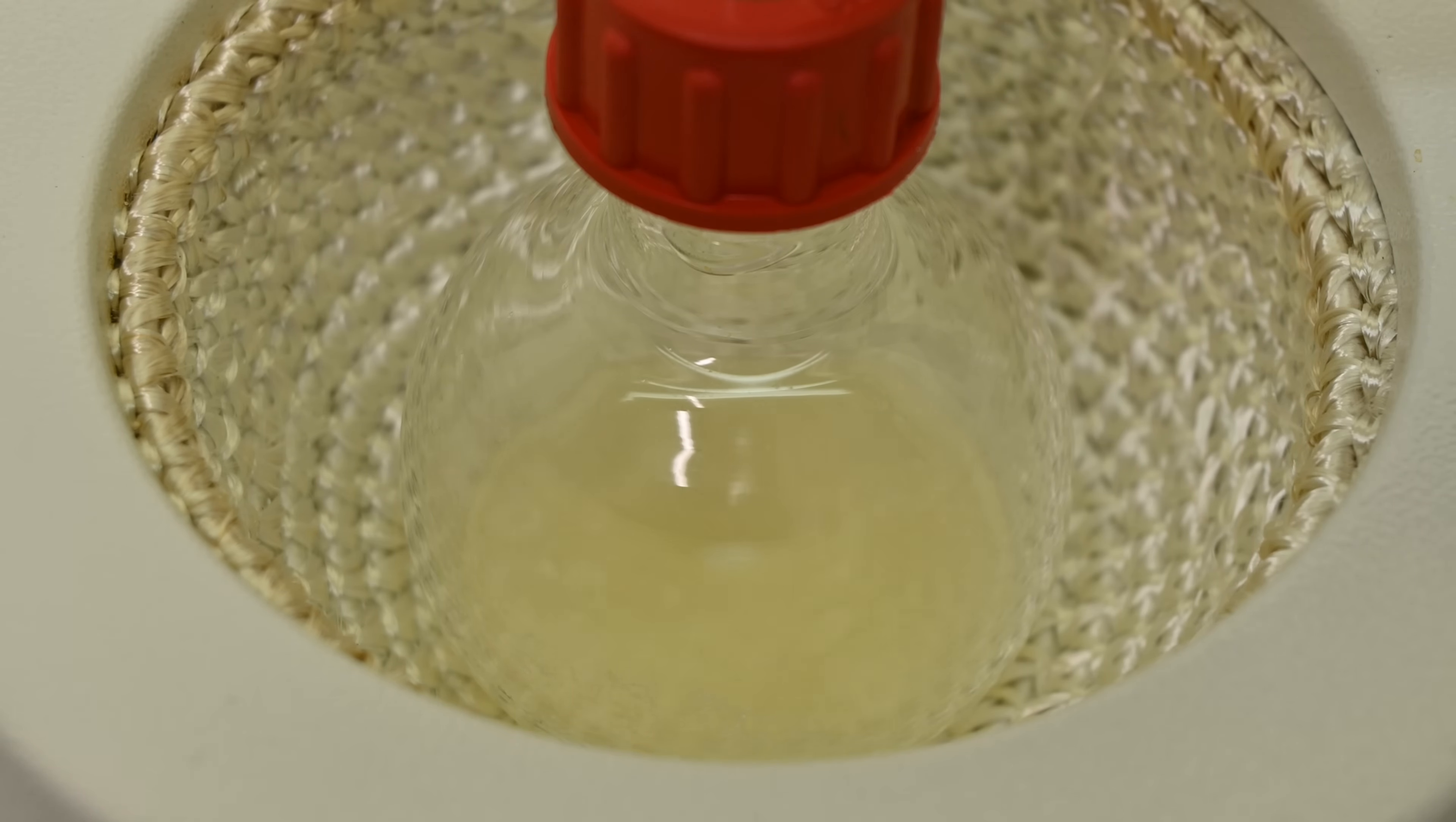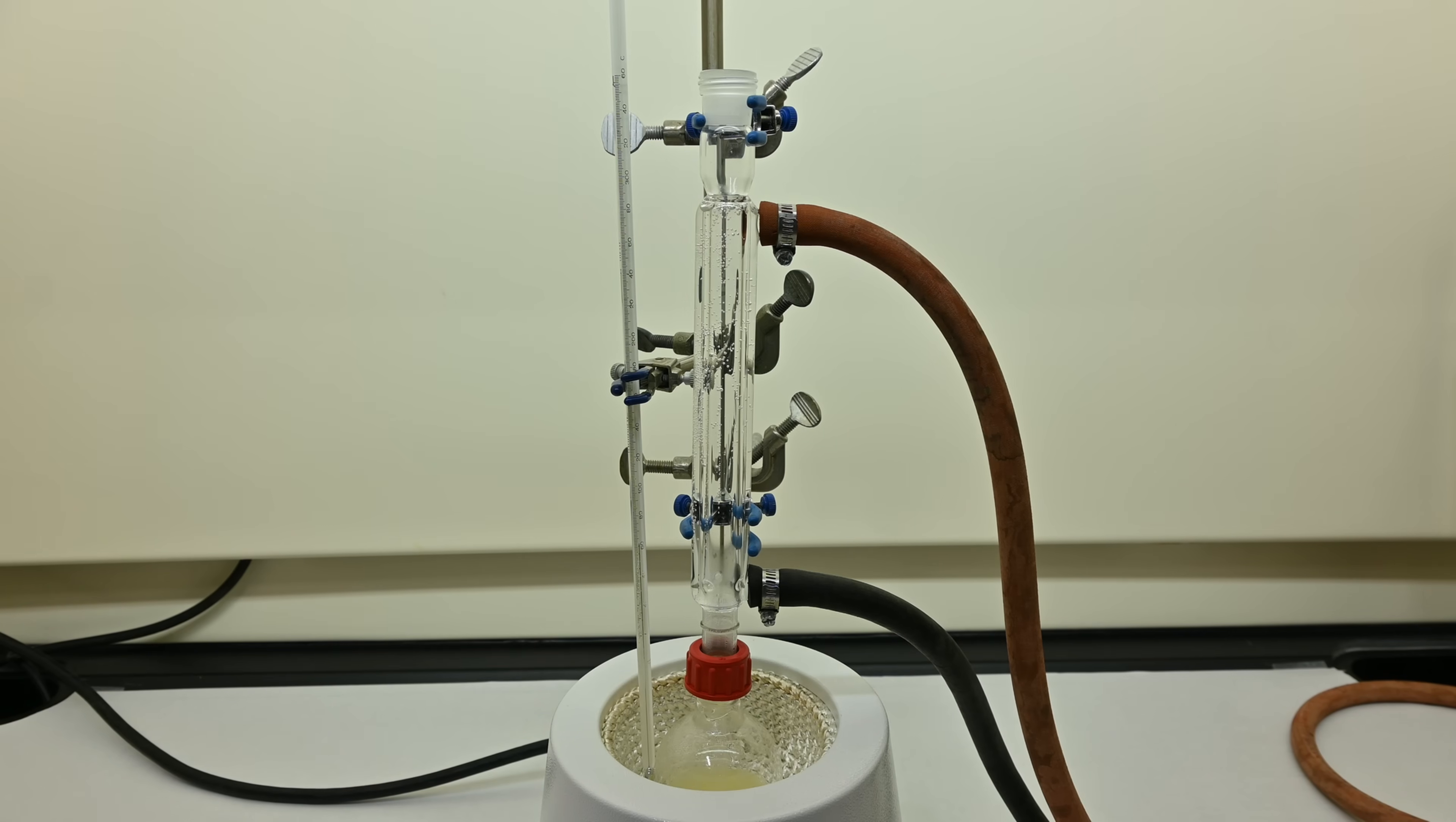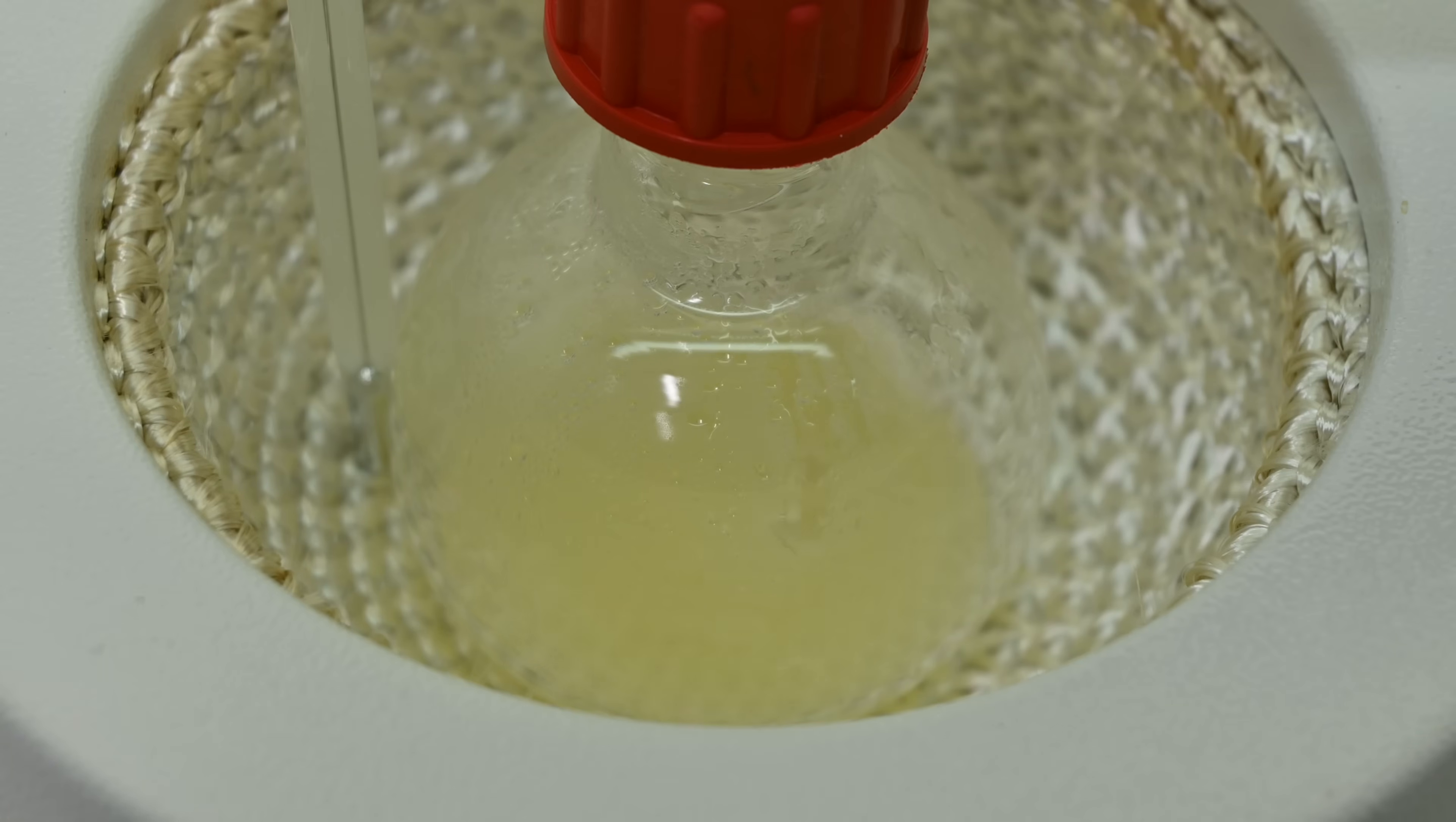Thionyl chloride reacts with carboxylic acids like P-nitrobenzoic acid, replacing the hydroxyl group with a chlorine, and producing an acyl chloride, a much more reactive intermediate that I'll later use in this synthesis. Think of it as swapping out a weaker attachment, the OH group, for a stronger, more reactive chemical handle, the chlorine, that can better participate in the downstream reactions.